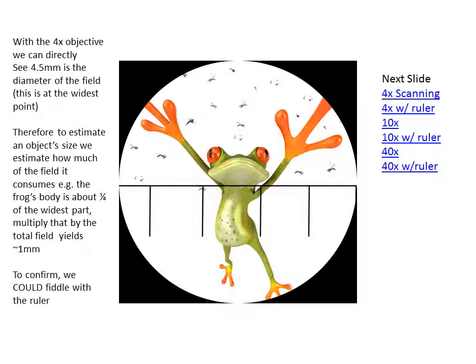the difference in magnification. So when you go, for example, from 10x to 40x, it'll be 4 times as magnified using the 40x lens. So objects will appear 4x bigger. However, the field will in fact be 4 times smaller. And that inverted relationship is what throws most of the students in this class. Despite this being heavily weighted on the test, only about 50% of the students get these points. So I want you to practice. I've created a separate exercise, and I will explain it to you as many times as necessary.